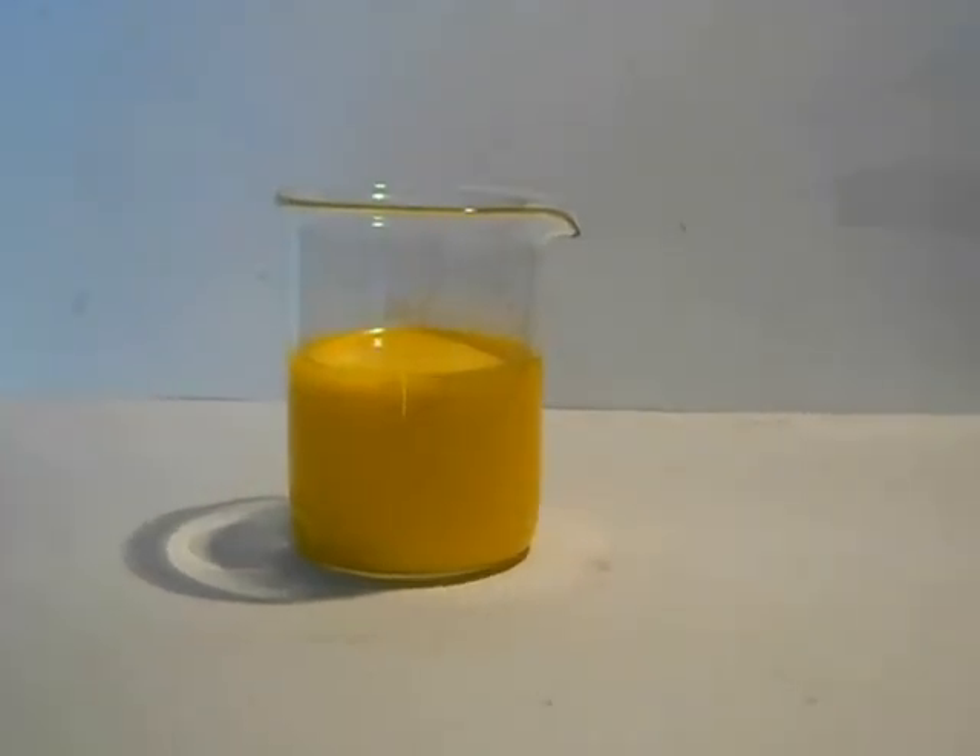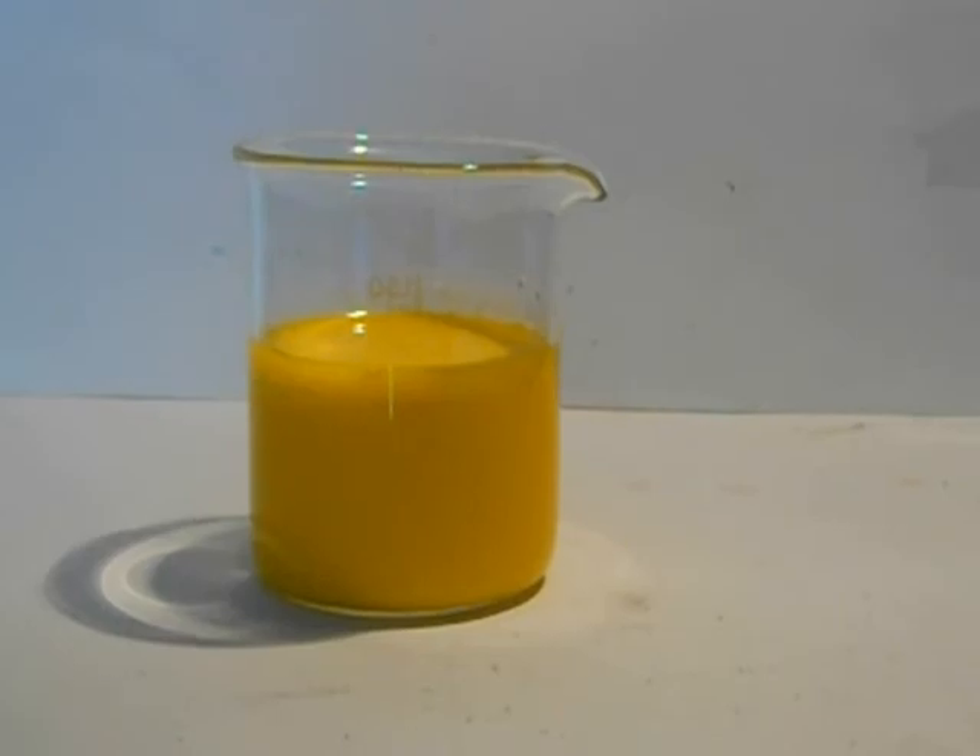That's all the precipitate without filtering. Now filtrate and let it dry.